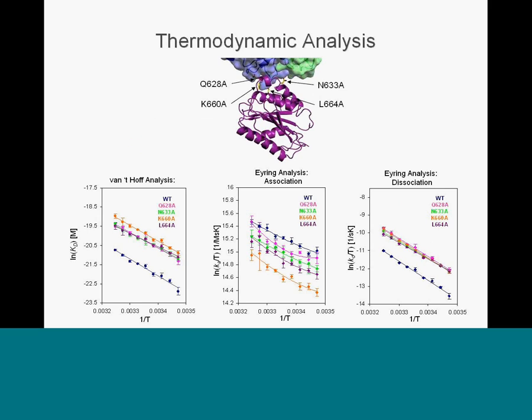Yeah. You have a unit there, log Ka over T. Right. And so the units here are in moles and mole seconds and temperature. So it gets kind of complicated. If we look, for example, here at the ln of the Kd, the dissociation constant, I see. So in all the analysis, you apply the same unit in the scale, kind of like normalized to a standard.